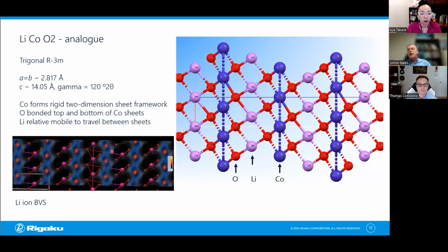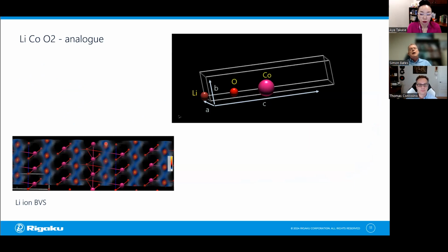That's what actually makes it an effective cathode material. And as my colleagues have pointed out, the width of this channel, the opening in the channel, is absolutely critical to how the battery material can function itself. So let's have a look at this crystallographic model in more detail. What actually is within that model that allows us to do these predictive calculations?